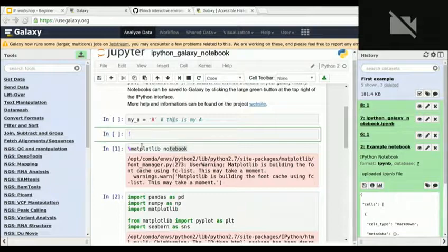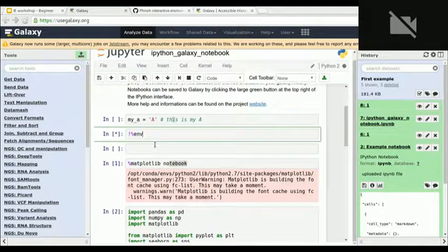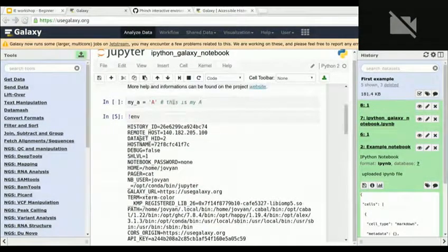Where is that one? It's in lib/galaxy/web/interactive_environments. Okay, thereabouts. Yes, there we can see. So we pass these credentials, like the history ID and the Galaxy API key, in as environment variables.